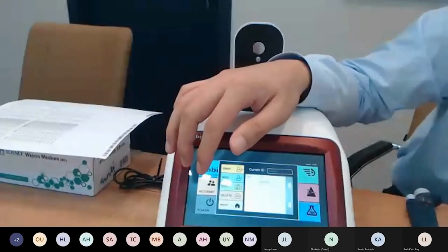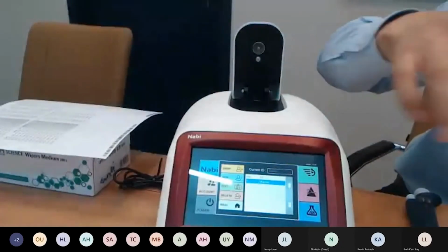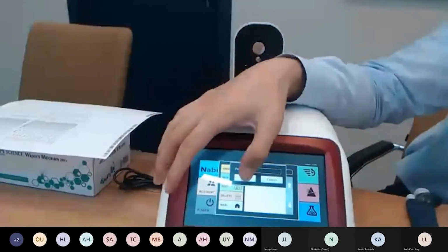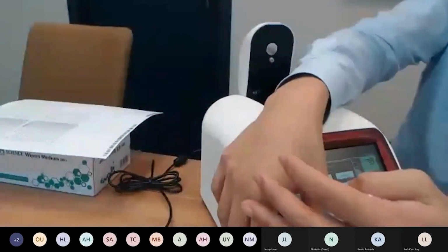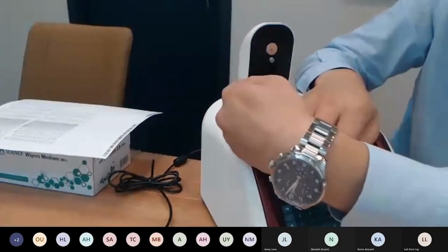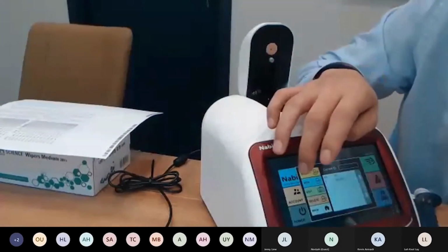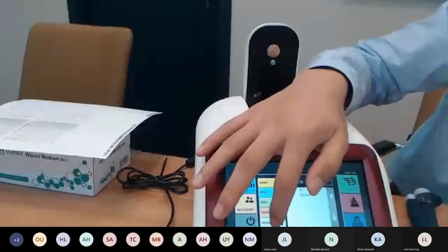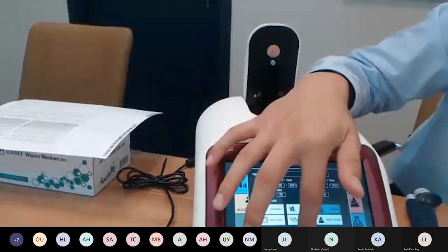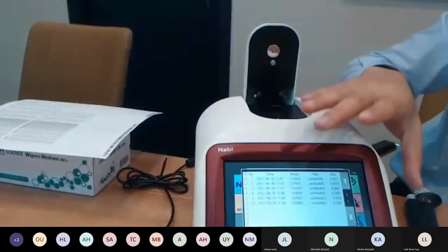All right, since I just switched accounts, of course, sorry about that. I got confused for a second because there are no measurement results made with this account. There's no data, obviously, but then you cannot see this. Hold on one second, please. And we're back at master, and we'll be able to search the accounts. Apologies. If you click all, then you'll see the measurements that we did previously for OD.